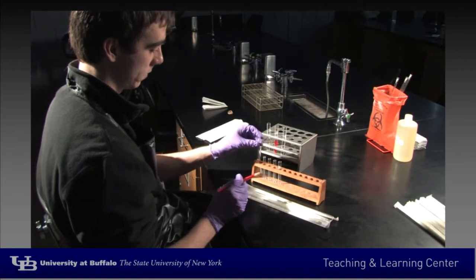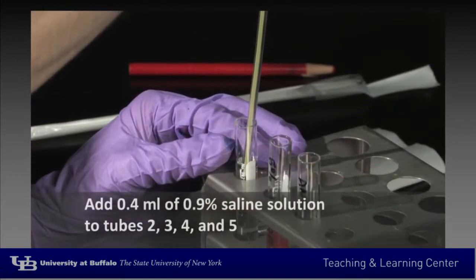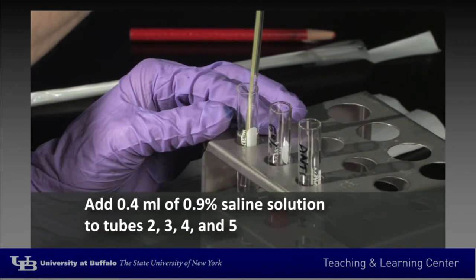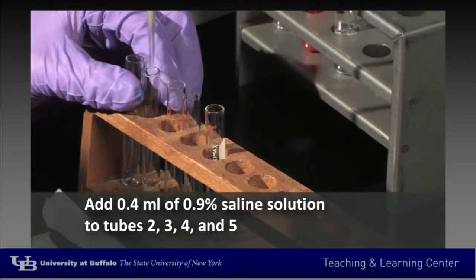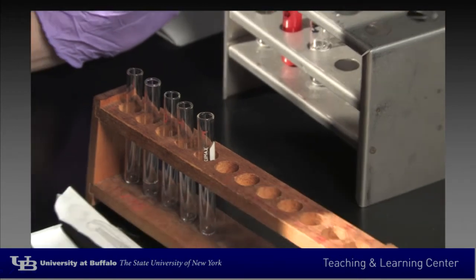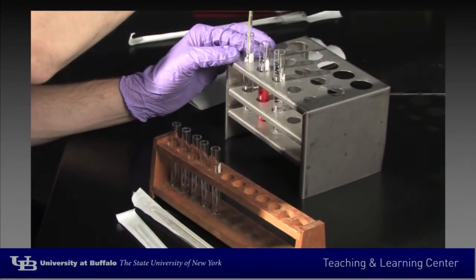Label the tubes from 1 through 5 and place in the rack provided. Add 0.4 ml of 0.9% saline solution to tubes number 2, 3, 4, and 5. The 1 ml pipette is divided into tenths and is referred to as a to-deliver pipette.